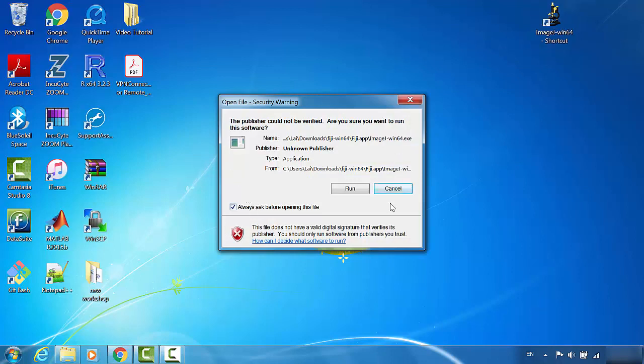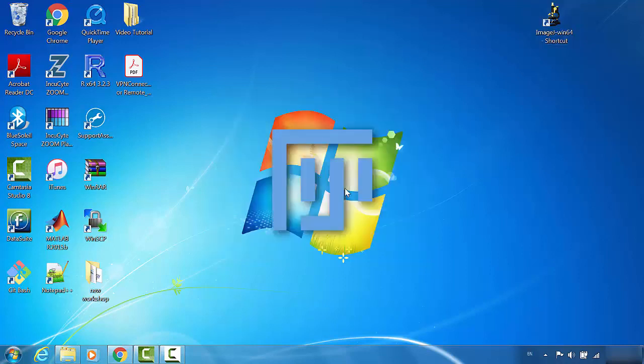For the first time, it always shows this. I will check not always ask this. Now it will run. If it's the first time you install ImageJ, it may take some time to start, maybe up to one minute.